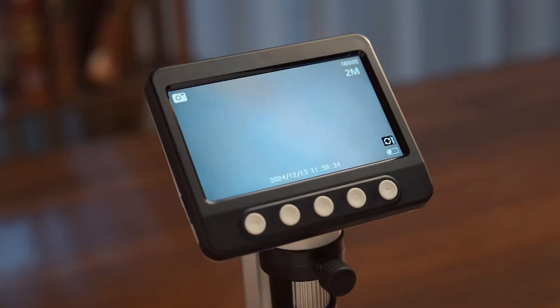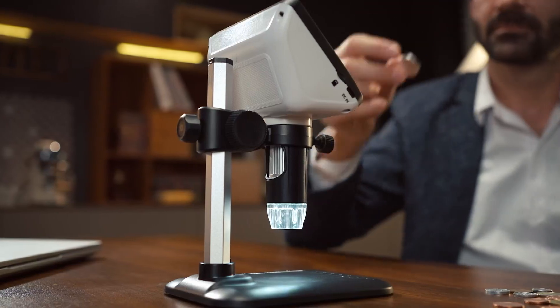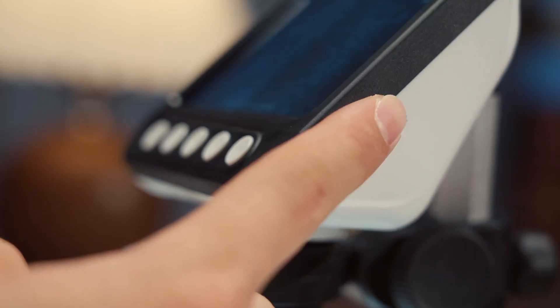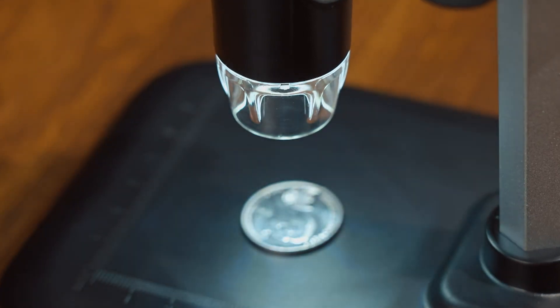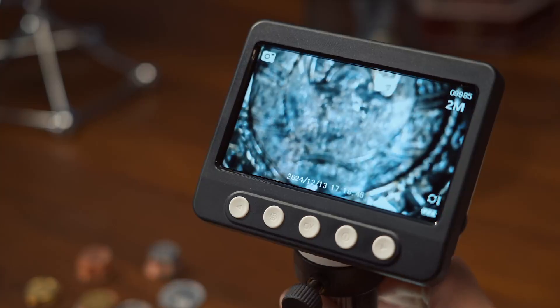Are you looking for a digital microscope but unsure which one to choose? You're in the right place, and that's exactly what we'll help you with. Whether you need it for electronics repair, biological research, or hobby exploration, a quality digital microscope should offer high magnification, clear imaging, and easy connectivity.